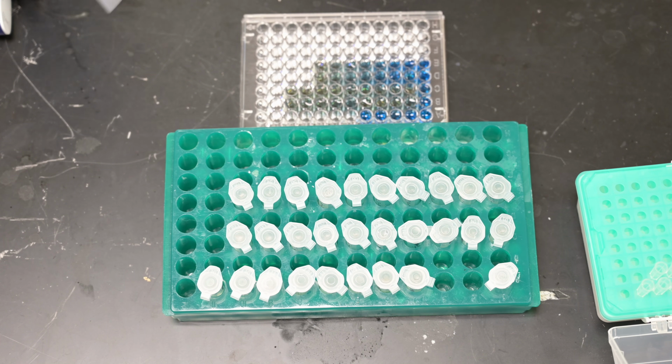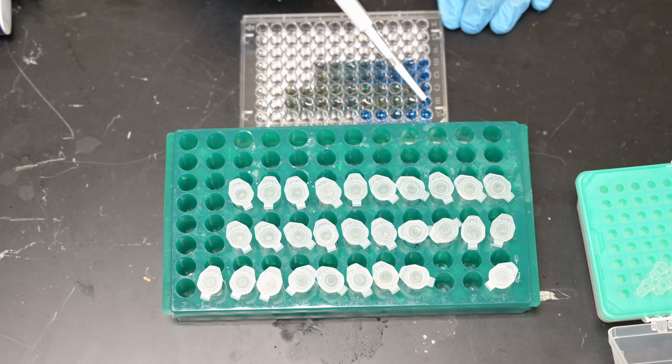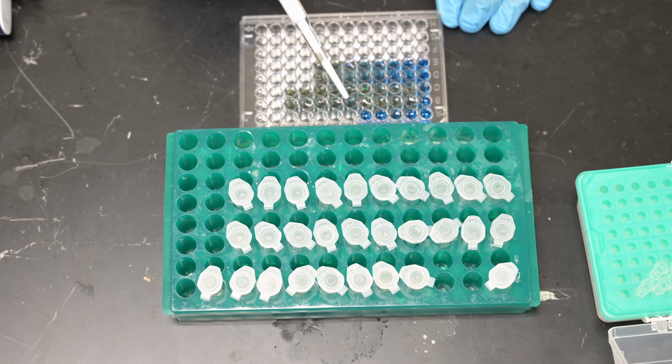So what I've now done here, let's go through this again. The plate has the lysate, 2-fold, 4-fold diluted. The load samples, we have the wash samples, so 1 through 5. We have the 0.1 molar 1 through 5, 0.3 molar 1 through 5, and 0.6 molar 1 through 5. And then we have standards loaded on the plate, 2 mg, 1 mg, 0.5, 0.25, 0.125, 0.0625, 0.03125, and then water, in duplicate here.